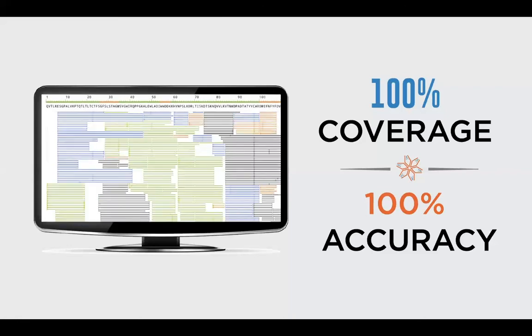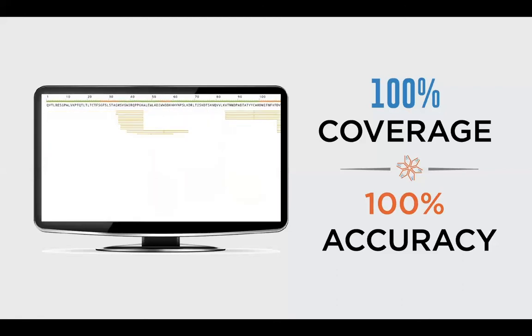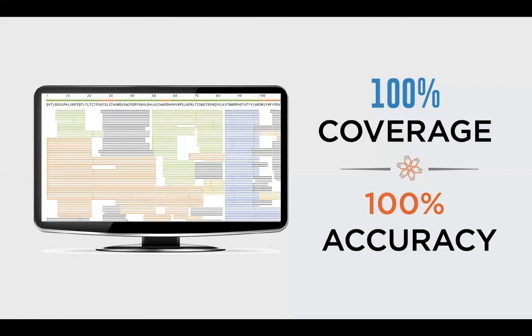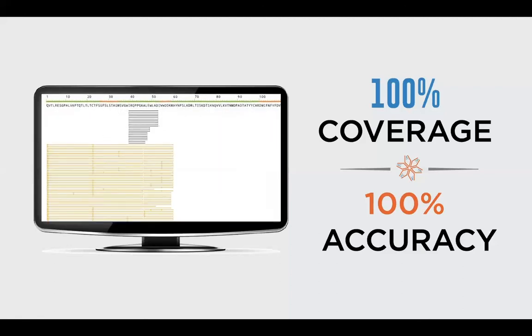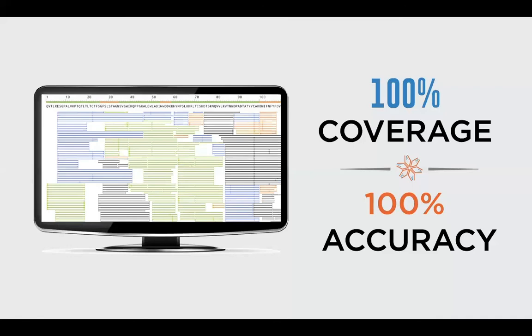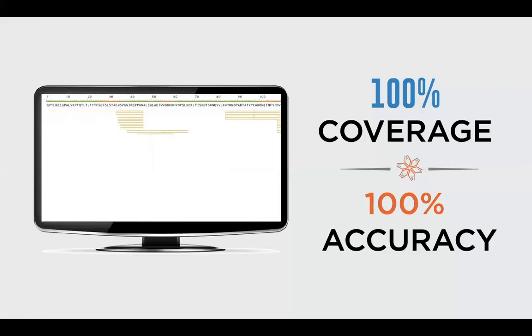So when we're looking at every single amino acid position, we actually have a minimum of 30 times coverage, and we're regularly seeing hundreds of peptides backing up every single amino acid position. And we want to make sure that there's evidence from multiple different proteases so that we can be completely confident in the actual results that we're delivering, that it's not just from a single peptide that we're making a call that this might be a lysine. Essentially, we want to make sure that there is evidence from multiple different peptides derived from multiple different proteases.